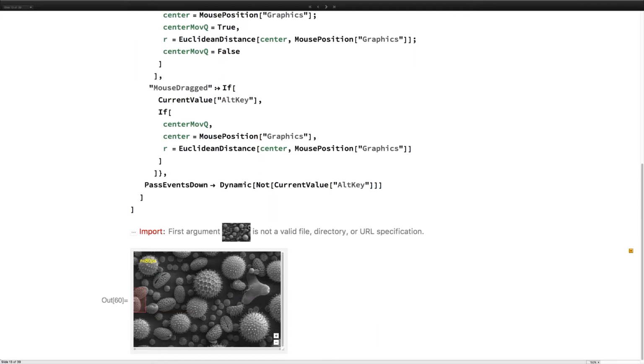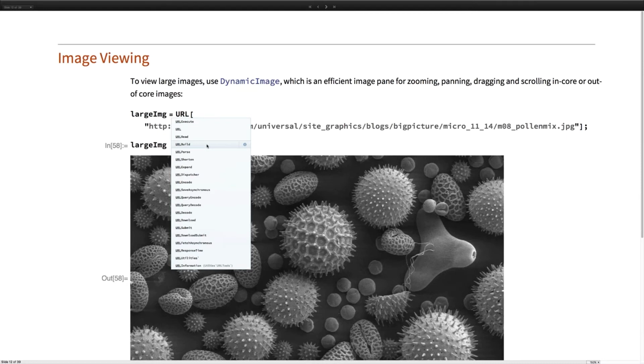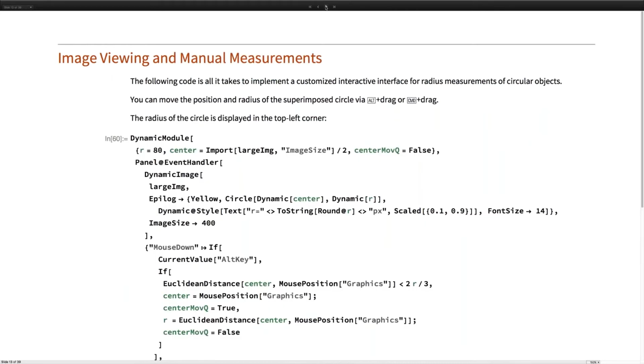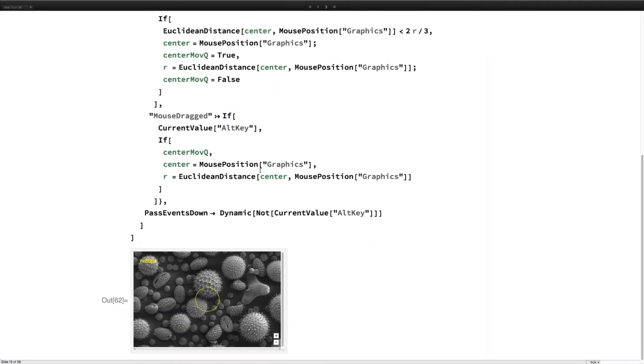some remark, but well, this argument. Okay, that's why I didn't make it here. What was original? It was URL download. Sorry, I have to get this because this was now programmed to handle just a file, because it just imports the file on demand. So I have to do it once again.